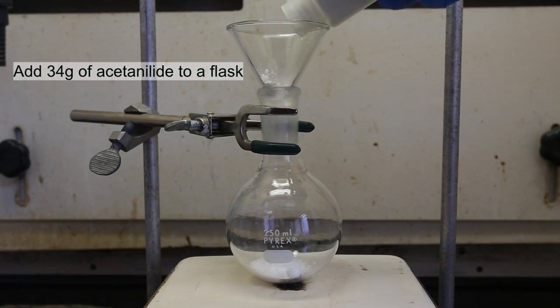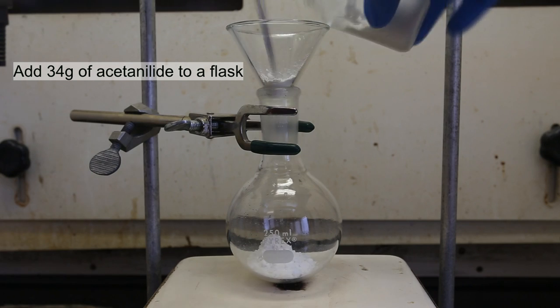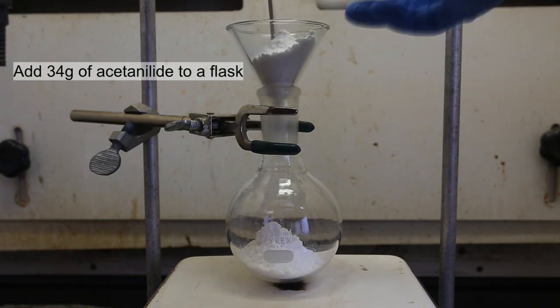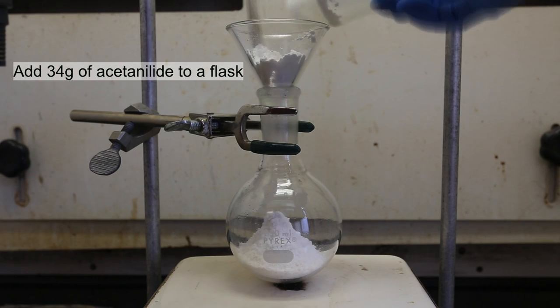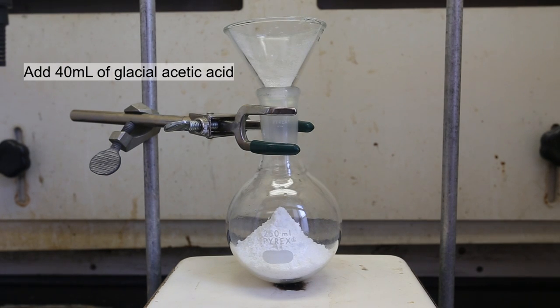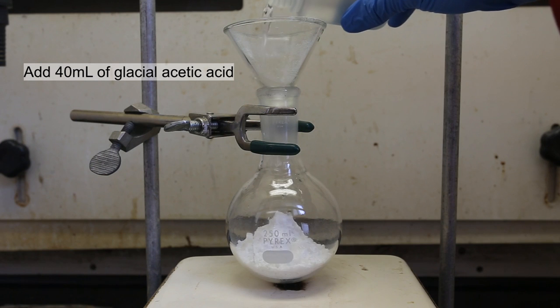First, add about 34 grams of acetanilide to a 250 milliliter round bottom flask. I only had a single necked round bottom flask available, but a three necked round bottom flask would be ideal as it would allow for the use of an addition funnel. Next, 40 milliliters of anhydrous acetic acid was added.